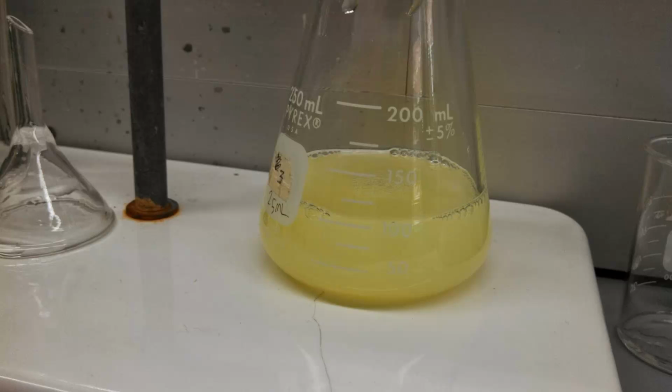As you start the titration, this yellow color is going to start to get cloudy and dull, and this is due to the formation of your silver chloride precipitate. The color that you're looking for, it's sort of blurry here, is this rose pink color, and so at a certain point after maybe 10 or 15 milliliters of titrant, you'll be able to see a significant amount of this pink color forming around where the stream from the burette is entering your titration flask.